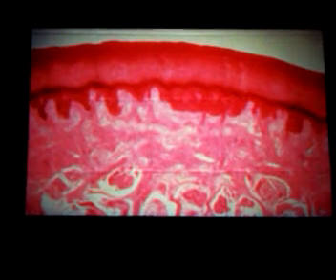Here we have the skin that's actually stained with a red dye, but it's shown with polarizing light. So you'll be able to see some crystalline nature to this as you go up in magnification. But what I want to point out is here you know where the dermal papillae are, and you know where the epidermal ridges are. You know where all of that stuff is. Here's a duct. There's a duct going through. But you see these little structures going deeper into the dermis. These are the structures that are called the interpapillary pegs.